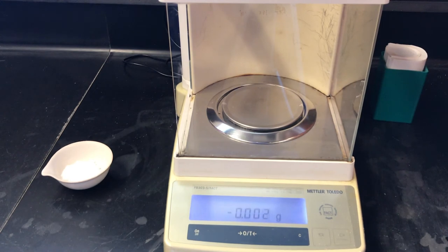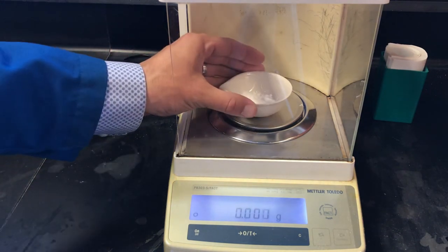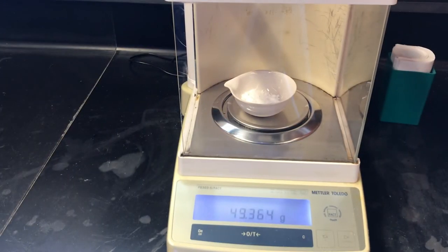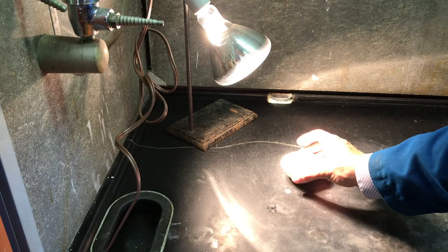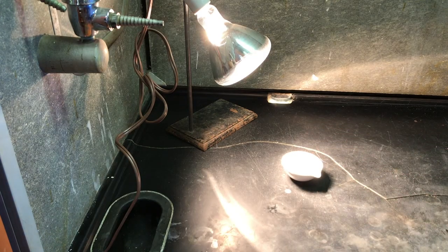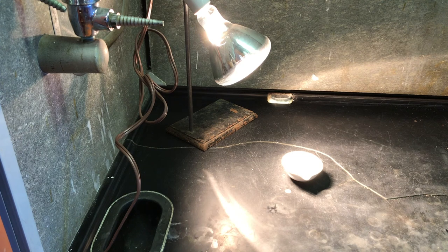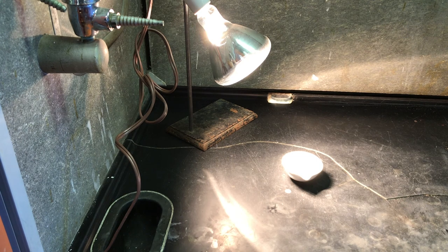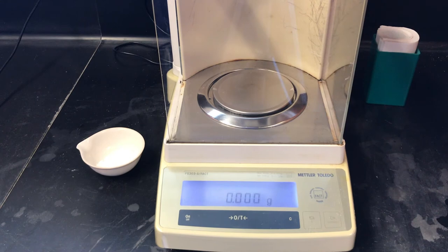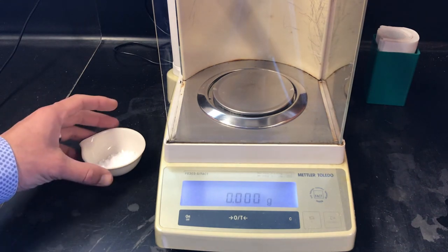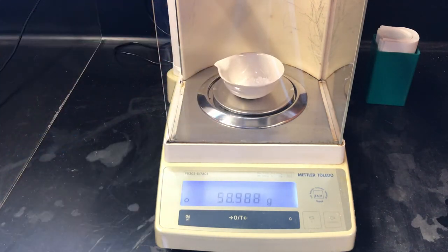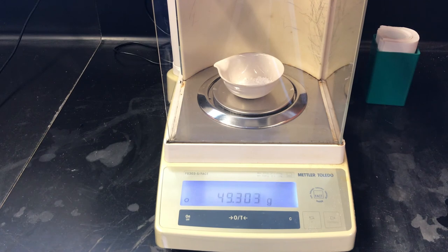After another 15 minutes, the mass of the alum after the third drying is 49.364 grams. The mass of the alum after the fourth drying is 49.302 grams. So we'll continue to dry our product.